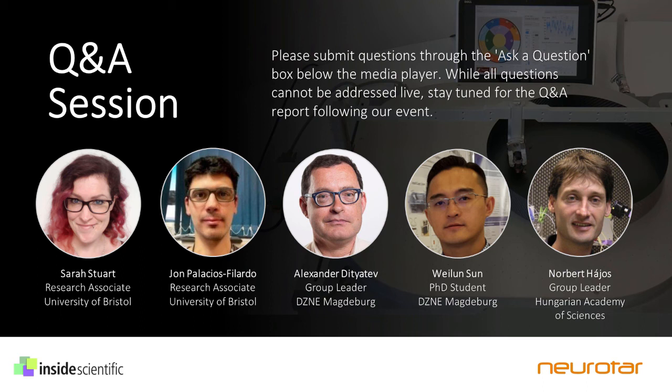So if we're just talking about getting the mice to run comfortably around the mobile home cage, I'd say that we see them doing that within just a couple of short sessions of head fixation. But factors that I would think are quite important in helping them do this: we give them running wheels in their cages, and make sure that the mice are well handled before the training starts.